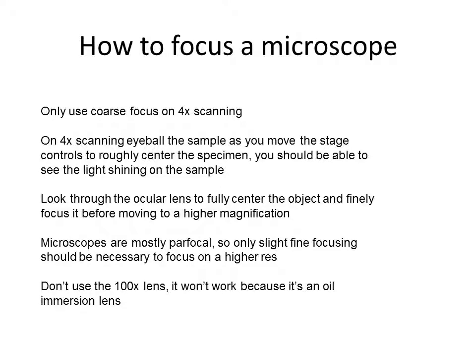This slide is about how not to be the person who breaks a slide on the first day of class. So I've already mentioned, and it is important, that you only use the coarse focus, the big old handle to move the stage up and down, when you are using the 4x scanning objective. So if you are at a higher magnification, only use the fine focus.